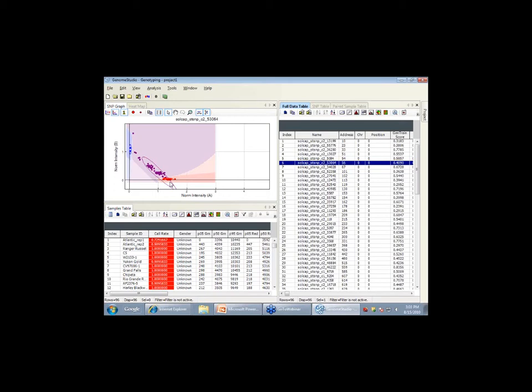So does everybody capture the 5 genotypes? With 4 genotypes, it goes from 4 A's all the way to 4 B's with different doses of A in it, and you get 5 possible genotypes in a tetraploid. But for now, let's just work with the diploid features, and then I'll extrapolate this, and then we'll show how the tetraploid data can be analyzed.